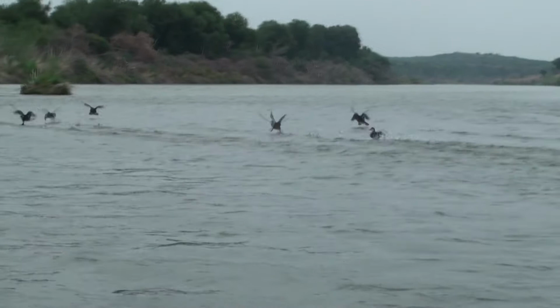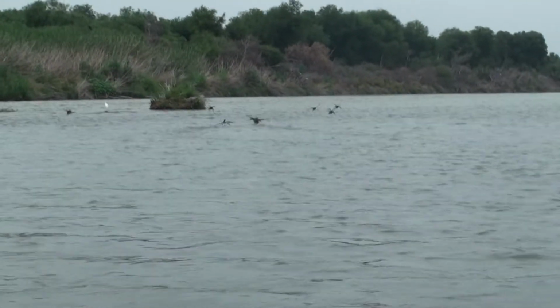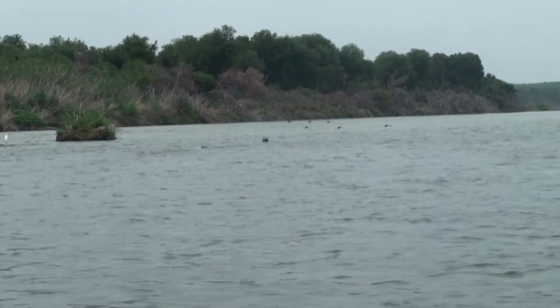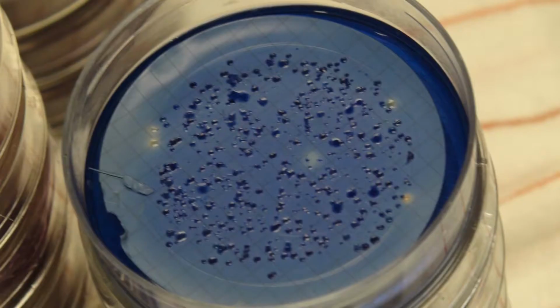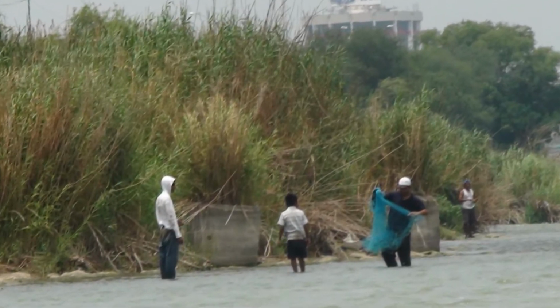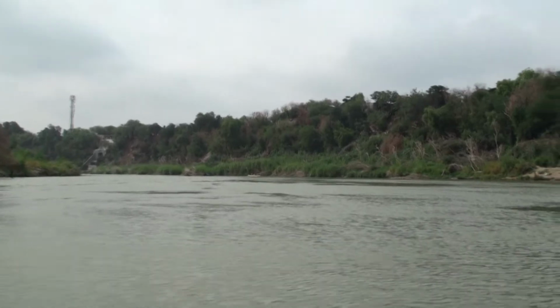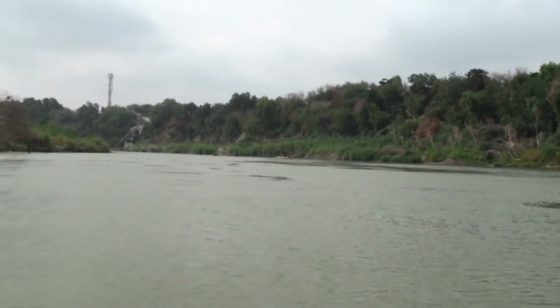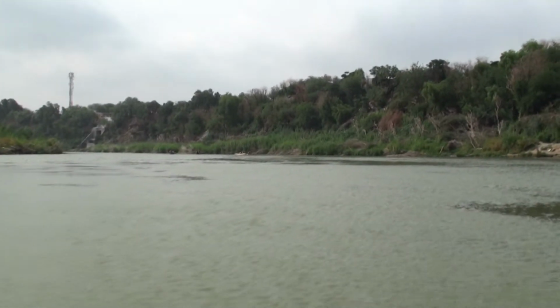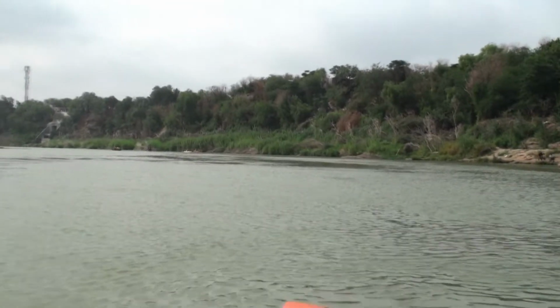The International Boundary and Water Commission's Texas Clean Rivers program for the Rio Grande Basin monitors water quality in the Rio Grande and its U.S. tributaries. Bacteria data provides information about whether the river is safe for swimming and other kinds of contact recreation. Bacteria levels are high in the Rio Grande in most urban areas in Texas, including Laredo, where the IBWC conducted a special bacteria study in 2011.